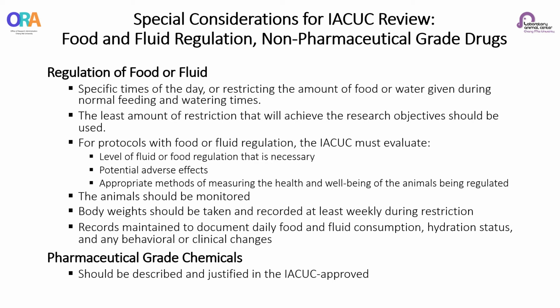In some studies, the regulation of food or fluid is required. This may entail scheduling access to food or water during specific times of the day, or restricting the amount of food or water given during normal feeding and watering times.